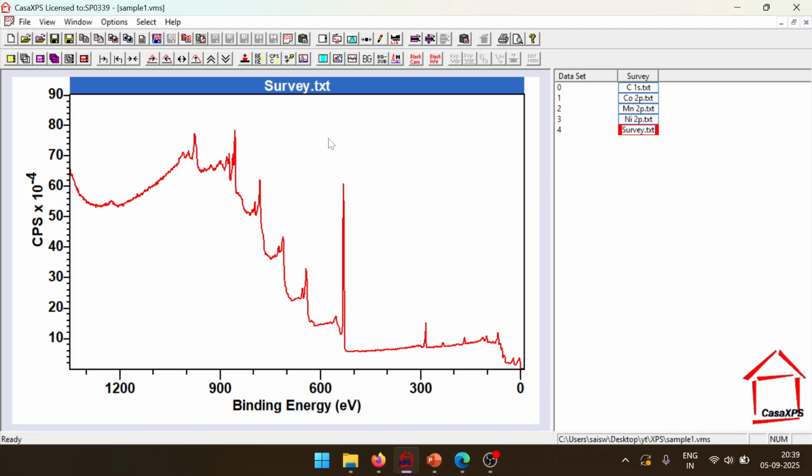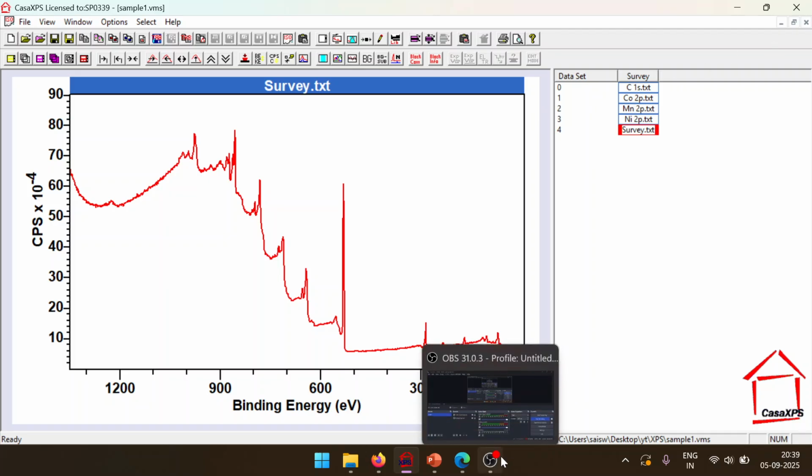So this is how we do this stoichiometry from survey spectra. And that's it.